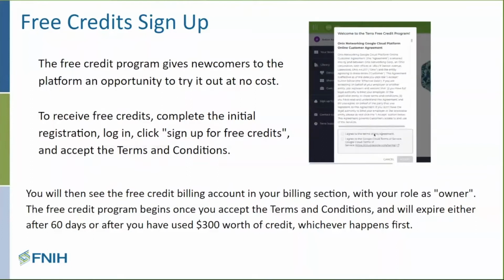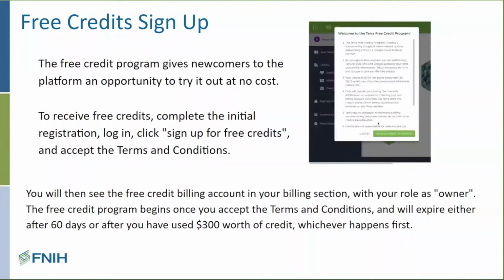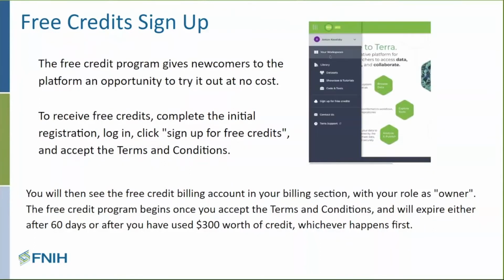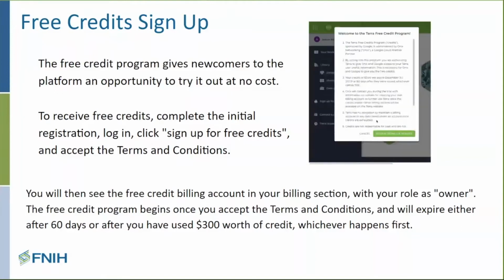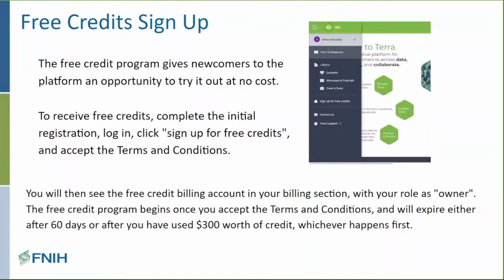If you have signed up for Terra, and if you're able to log in, that would be great. You can go ahead and go to your Terra account and follow along with me. And if you haven't logged in, or if you haven't accessed your free credits, you can certainly do so now.